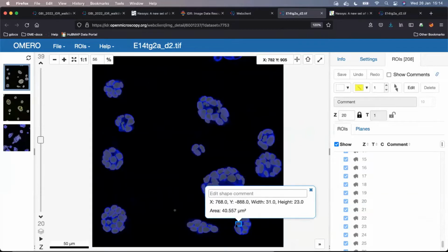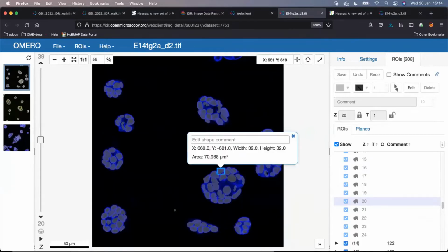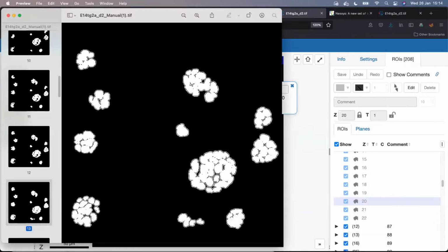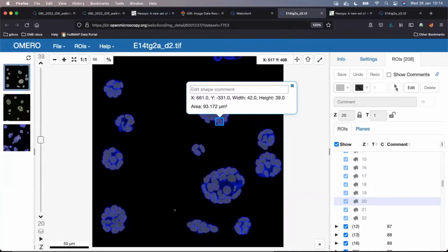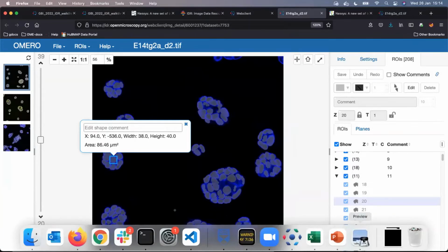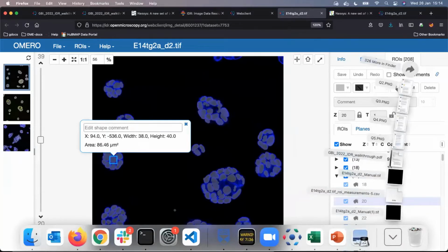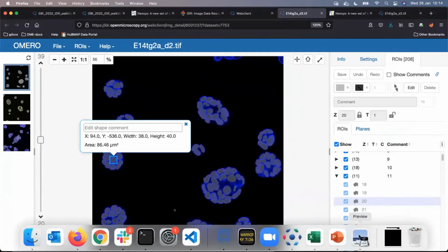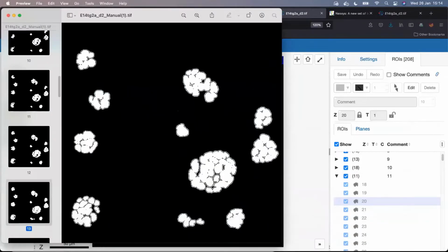Now, technically, computationally, these things which I'm clicking on and this TIFF which I downloaded have now nothing to do with each other. If I delete each and every single TIFF from the IDR, it will have no bearing on these ROIs, which will happily survive. Okay, they are simply a different entity. In the moment when the Omero team, the OME team put the effort into turning this into that, then it made this image a little bit obsolete.